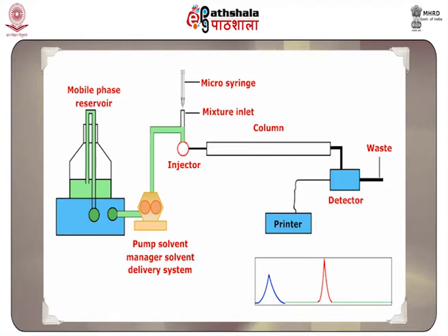The time taken by an analyte to come out of the column is called its retention time, which is an identifying feature of that particular analyte.